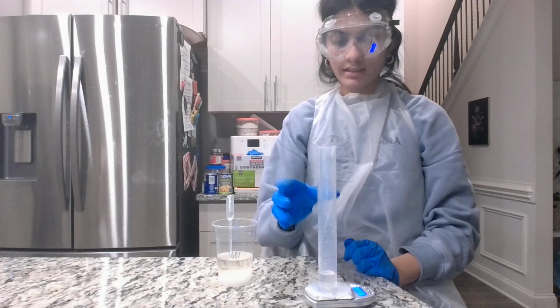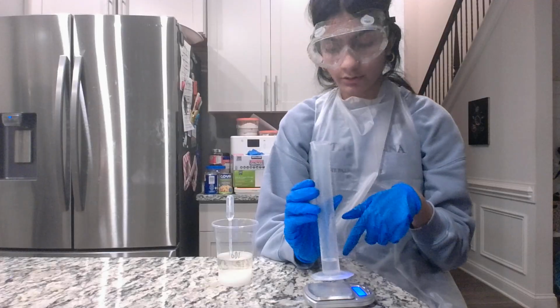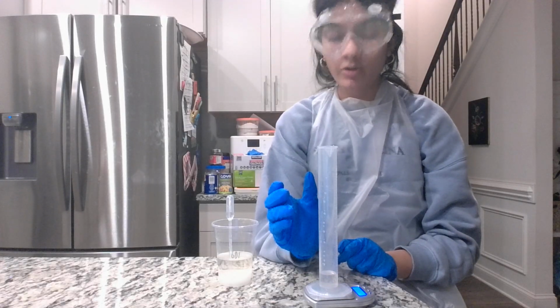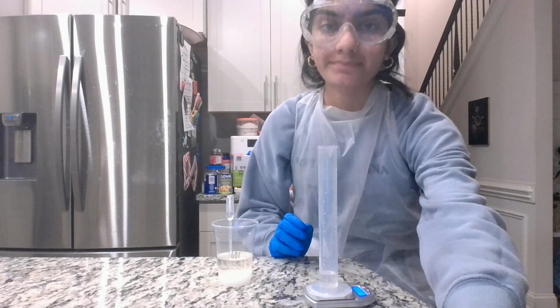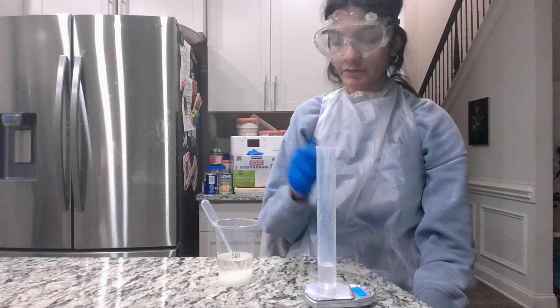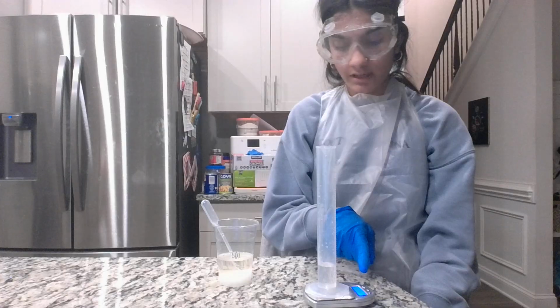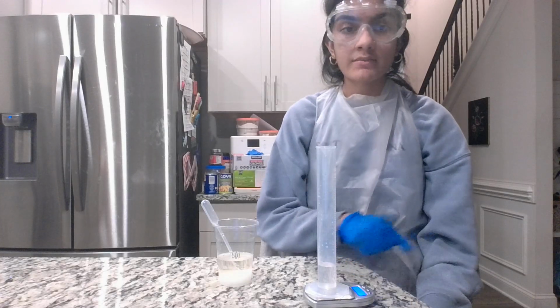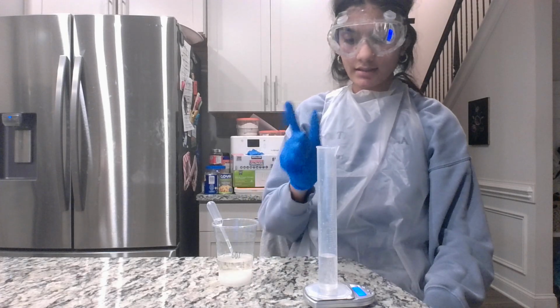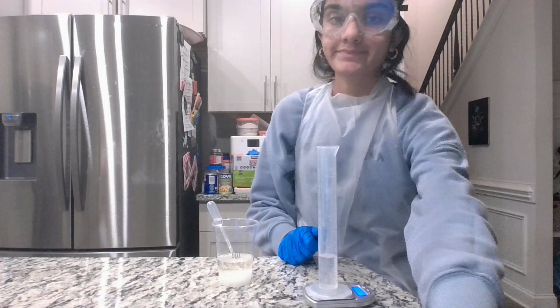So this is now 60% of sucrose in solution, and it weighs about 36.94 grams. This is 10 milliliters of 60% of sucrose in solution, and it weighs about 42.26 grams. This is 15 milliliters, and it weighs about 48.31 grams.